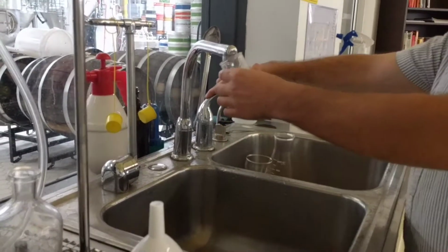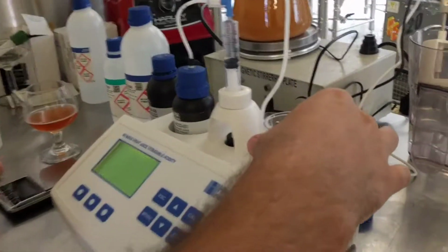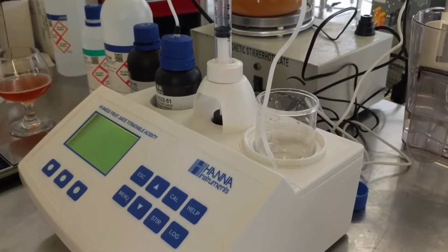Now, I should be using distilled water for this, but since we're doing a calibration, if you do the same thing every time, then it's still fine. Don't quote me on that.